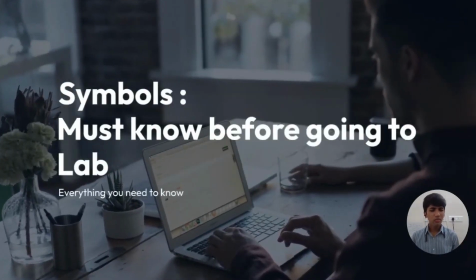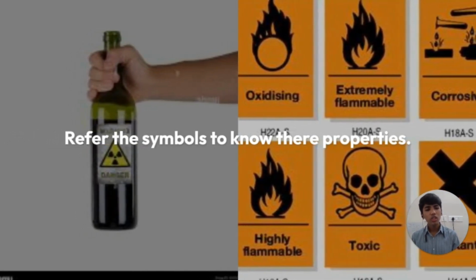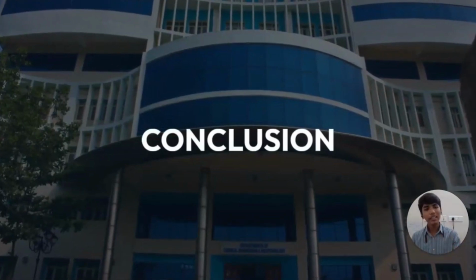Now you should know some symbols like oxidizing, extremely flammable. There are more symbols which you must know to avoid any mishap. They will help you know the composition of a substance so that it can be handled carefully.